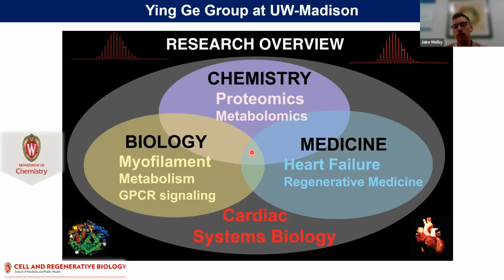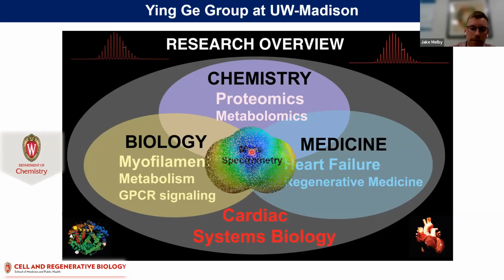And we also take medical students and collaborate with doctors on campus to study things such as heart failure and regenerative medicine, all under the lens of cardiac systems biology. But the one thing that connects us all within the group is that everyone is using mass spectrometry as the technology to study whatever the purpose of our project is.